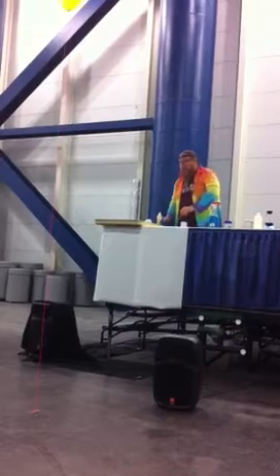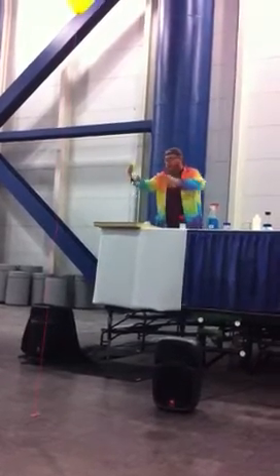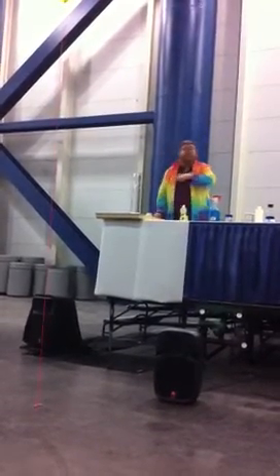Now what you have in your medicine cabinet is about 3% hydrogen peroxide. This is 30% hydrogen peroxide. So it's about 10 times as concentrated, but it's the same compound. The next thing I'm going to put in is some dish soap. Exactly that much.